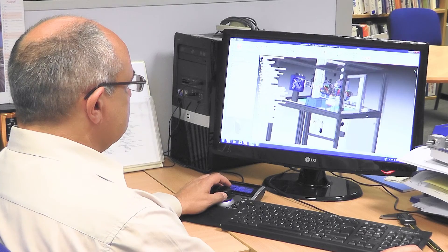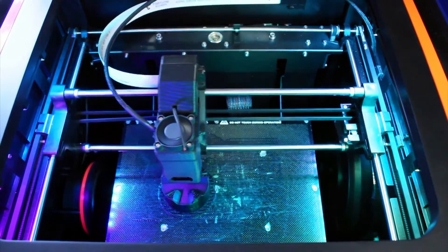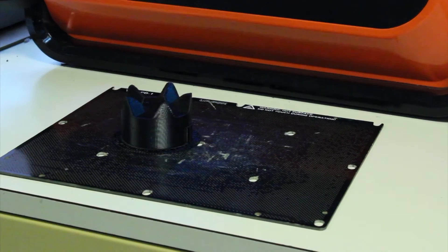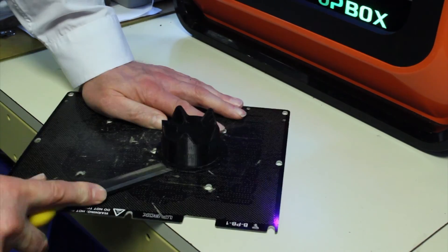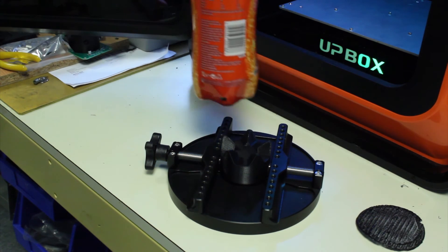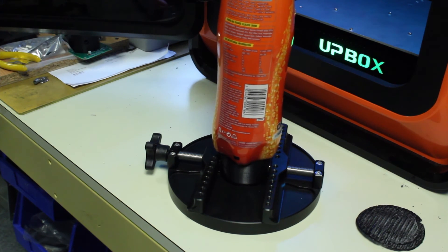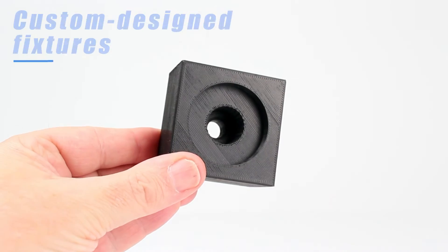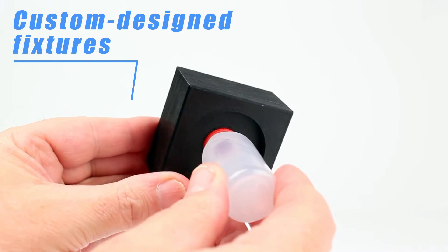However, if a custom-designed fixture is required, we have an expert, in-house design and manufacturing team focused on custom-designing grips and fixtures, for example, cap mandrels, to your exact requirements, assuring axial alignment, secure holding, and minimal deformation that might adversely influence test results and repeatability.